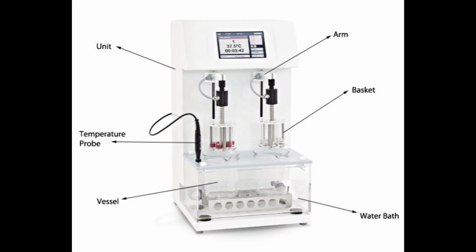Q. How do you know you've hit the endpoint in a disintegration test? Ans. Endpoint criterion: all sample residues have passed through the mesh aperture, leaving only soft masses or insoluble coating fragments on the screen.